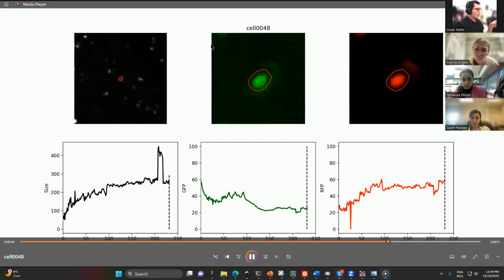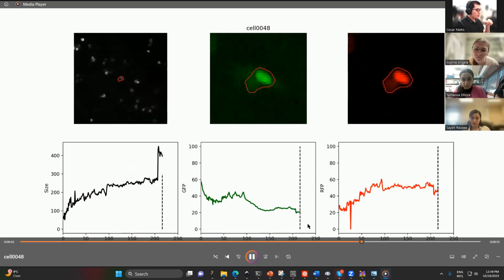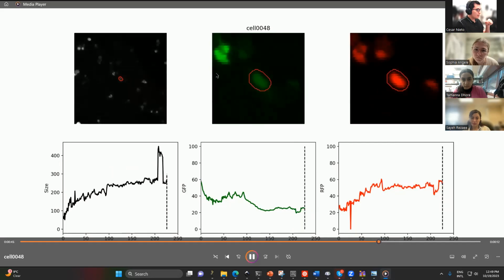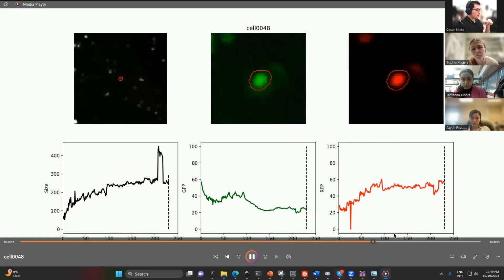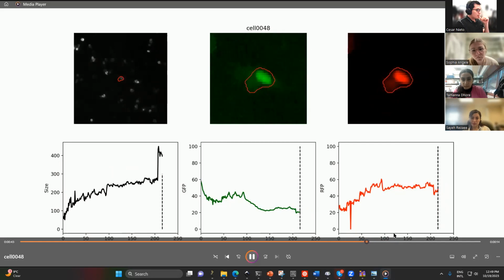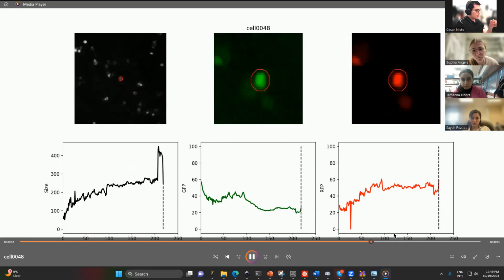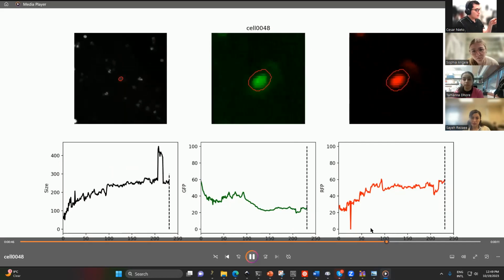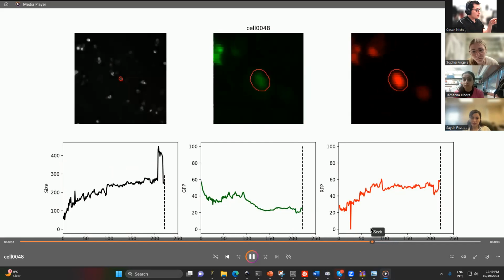Let's see here, in the beginning, at this point, you have a cell more brilliant on the left. So it looks like the cell got darker, but actually it's a similar intensity as here. Maybe because this cell here is more brilliant than the one we are studying.